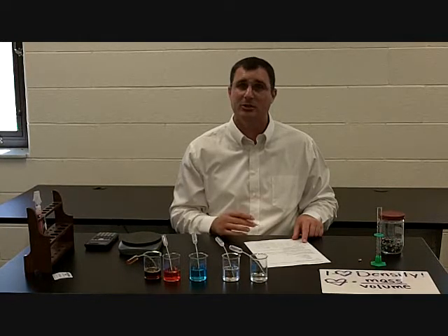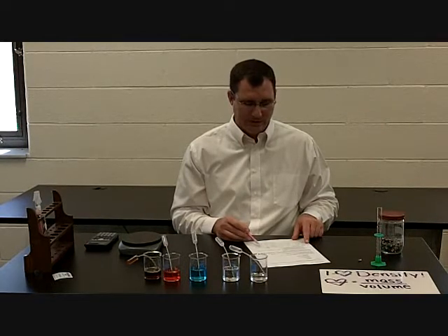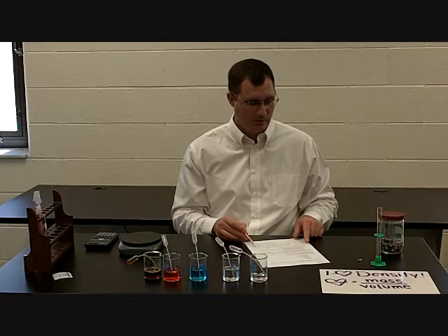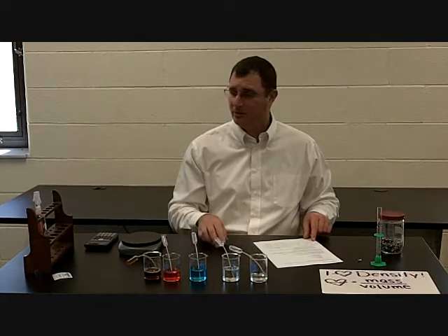It's less dense, so it should float on top of the water if all goes well. The fourth one is the mineral oil at 0.83 grams per milliliter. And then the last one, the least dense one, is the isopropyl alcohol at 0.79 grams per milliliter.